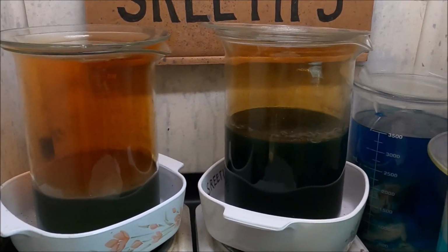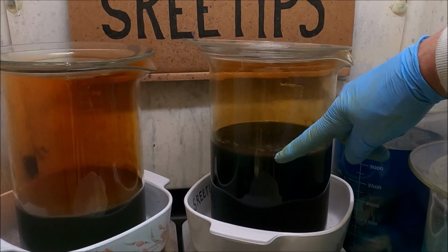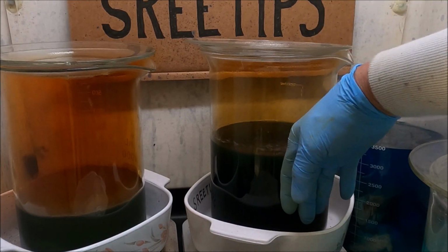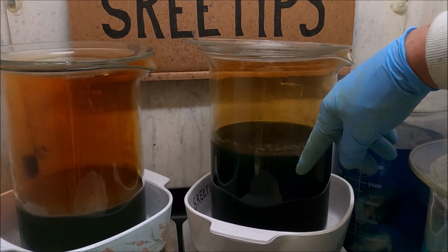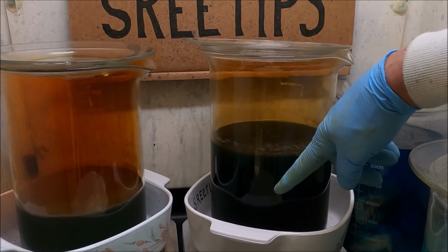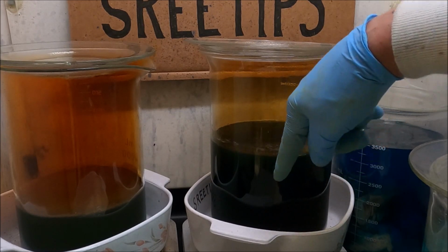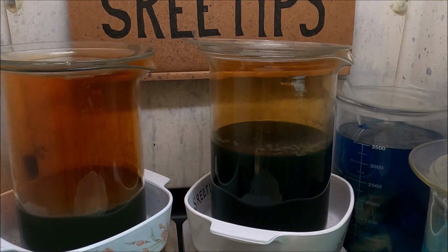On this beaker here, I think what I'll do is I'm just going to leave it on the heat until all the fumes go away, and then that will let me know that all the available nitric has been used up in here. And then I'll siphon this cleared, settled solution off, and we'll work with that solution and then dissolve the rest of the solids that's down in the bottom of the beaker.